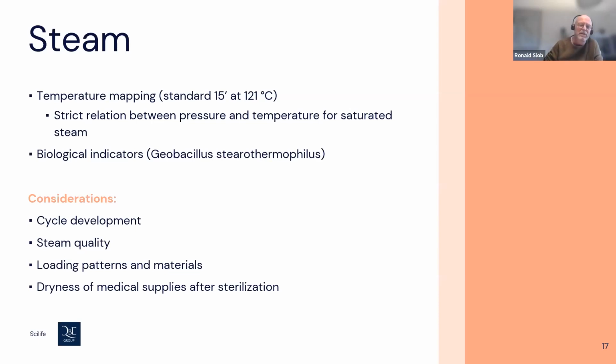When a pouch is wet, you don't have the barrier of the pouch material, so you contaminate your product again, after putting a lot of effort in. Because you have a lot of condensation inside the sterilizer, be sure you have a good drying phase at the end, before opening the door of the sterilizer after the cycle.